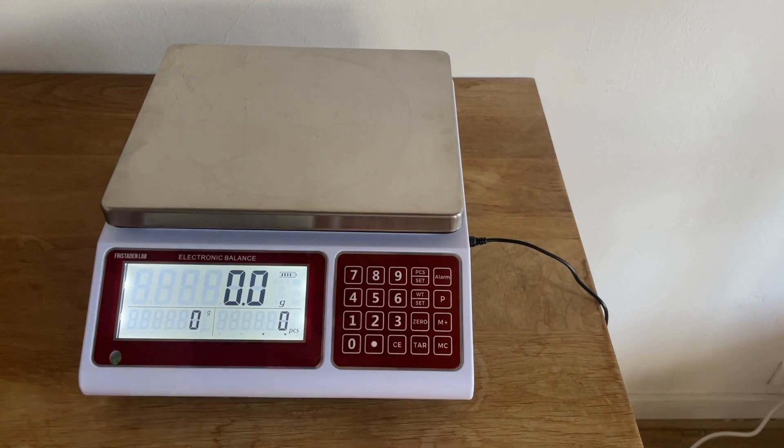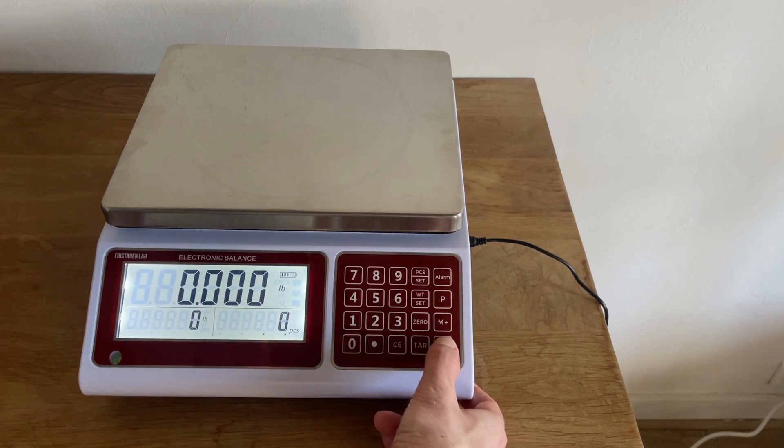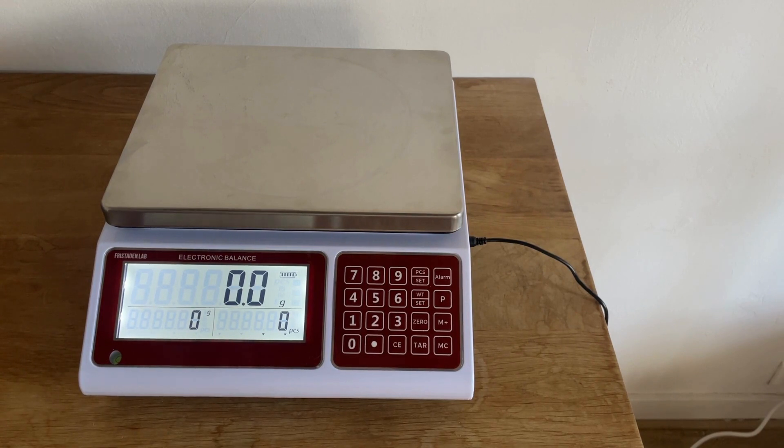When adjusting the scale, it's best to zero it first — that helps with accuracy. The first feature is the unit selection. You hold the MC button and it will cycle through pound, ounce, kilogram, and gram. The scale memorizes the last unit you used, so if you usually use pounds or ounces, it will always revert to that and you won't have to change it.